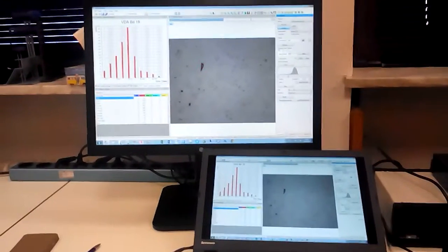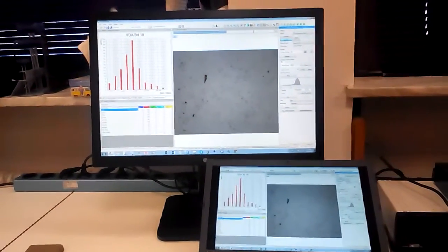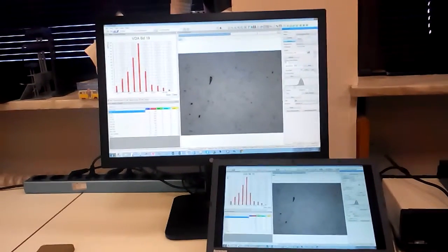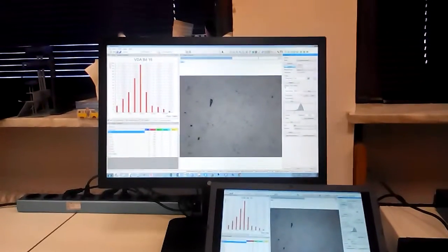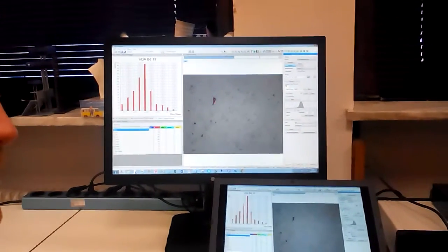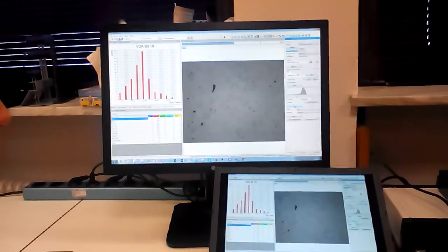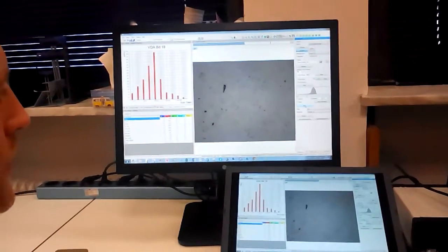Okay, so when we've done this, one important point: take care that the polarization filter is on, on for the first pass, for the threshold detection. And then we can start the measurement. Start with run.